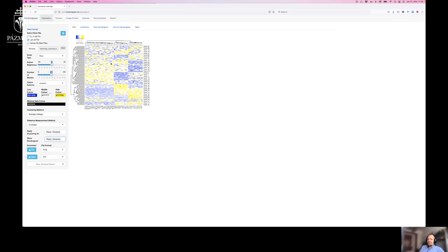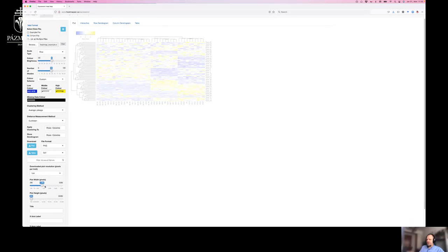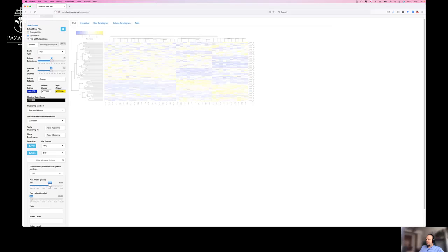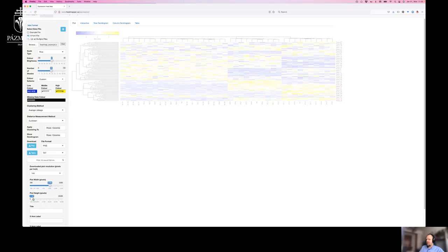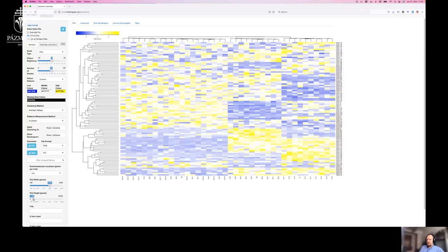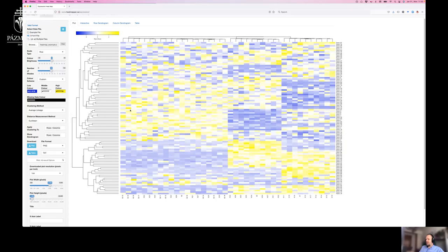In the heat map, we can see that it only fills part of our screen. So next, just click here, show advanced options, and add some width to make this picture more readable. Okay, so let's extend the columns as well. Just a little bit more. Okay, so here is our heat map.